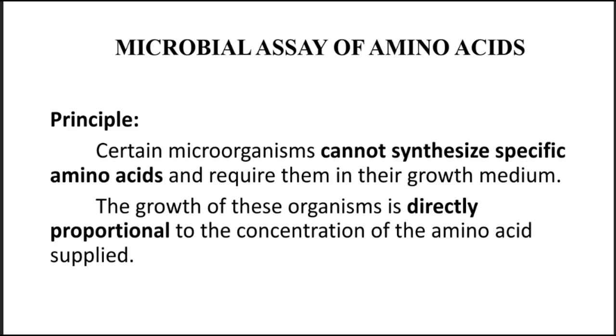Microbial assay of amino acid. Principle. Certain microorganisms cannot synthesize specific amino acid and require them in their growth medium. The growth of this organism is directly proportional to the concentration of the amino acid supplied.